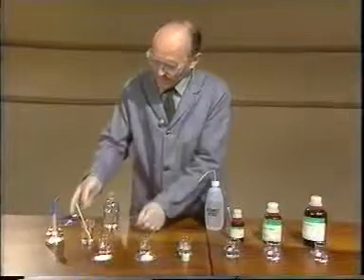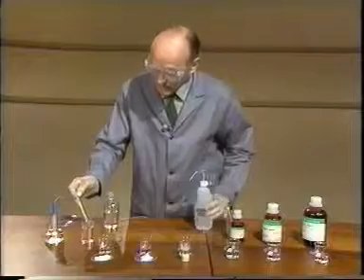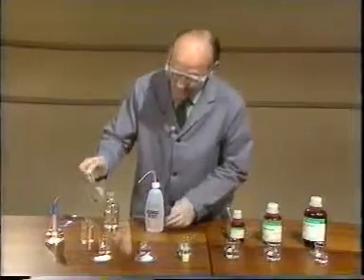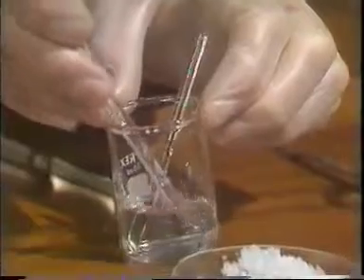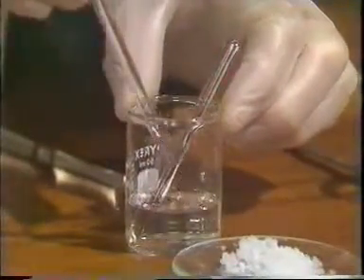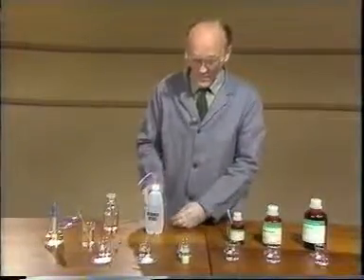I'll check the temperature, rinsing the thermometer first. 22 before mixing, and after mixing, again it's 22 degrees. So there's very little sign of any reaction there.